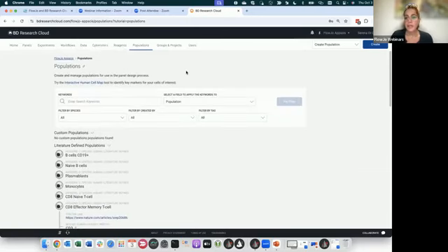If you have your custom population, because that's the best thing, right? Creating your own population, characterizing a new population is mostly our goal. You can create your own right here. So you can just click create and have your custom population.